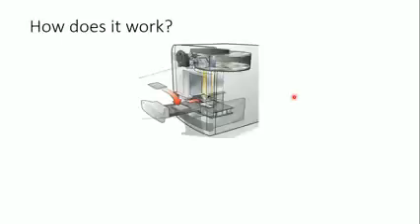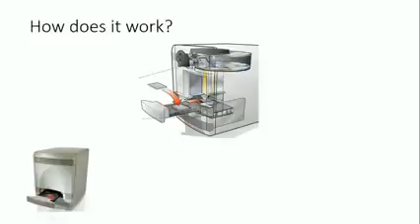So this is a diagram of the real-time PCR machine. Here is what we call the tube patch. It looks like this from outside. Here is where we put our tubes. Normally we use plates because we can apply real-time PCR to several samples at one time. So we can use the 96 wells plate or whatever.